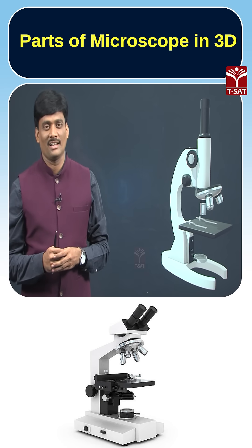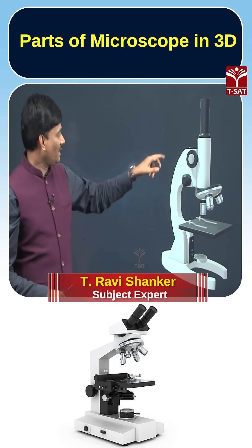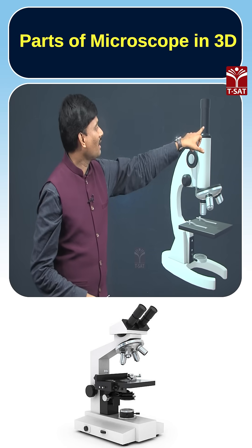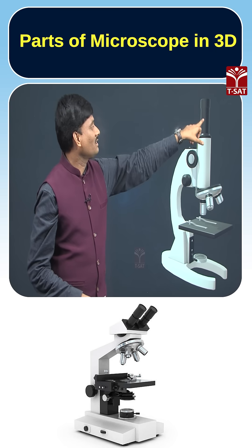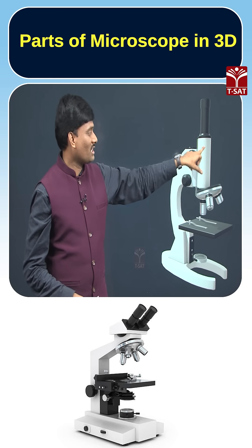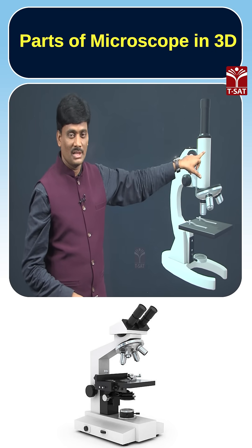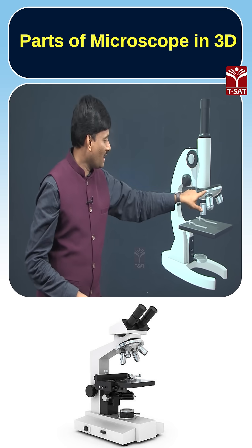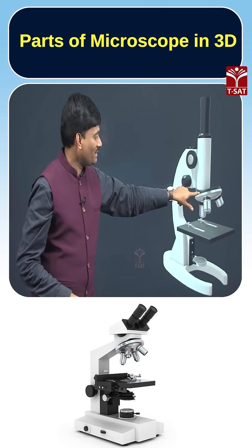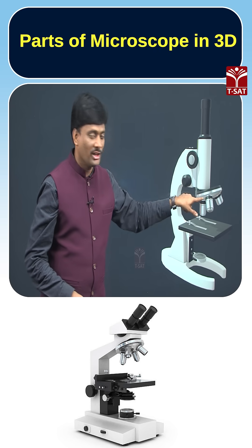The parts that are present in a microscope: here you can see the eye lens or eyepiece, and then it is called the body tube. Next, here we have the revolving nosepiece.